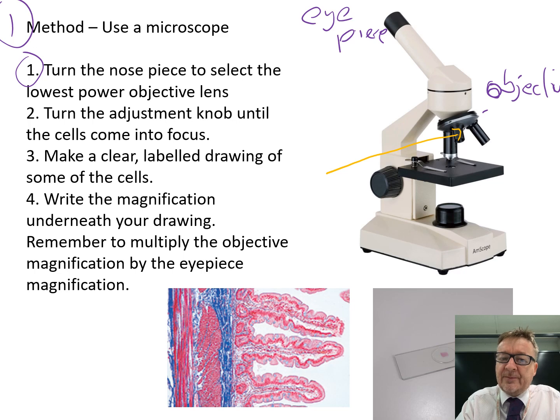Lower the lens as far as you can. You only focus by moving away from the slide - this prevents damage to the microscope or the slide when using longer lenses.